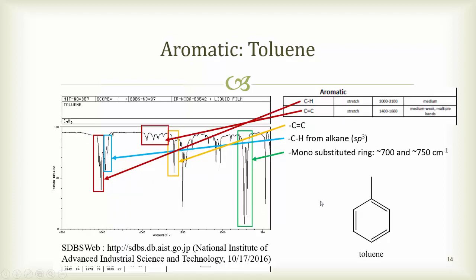Another example of molecules that you may be called upon to recognize and be able to interpret are the aromatic rings, specifically benzene rings. Now, benzene rings will have some other functional groups present in addition to what we need to look for here. So just to be aware, there is still an sp3 hybridized carbon, and there are hydrogens attached to this carbon. So we still see those carbon-hydrogen sp3 stretches just below 3000 wave numbers. They're still going to show up.